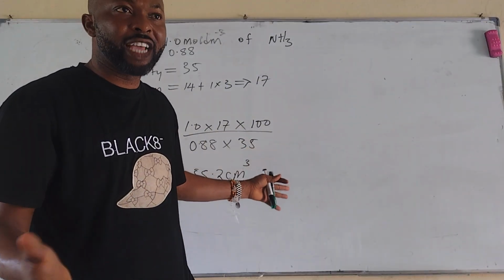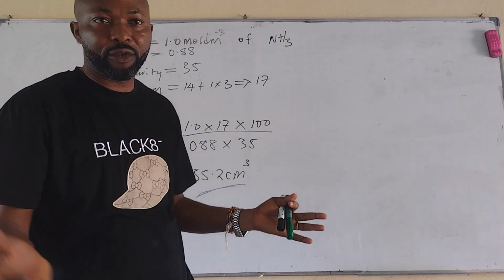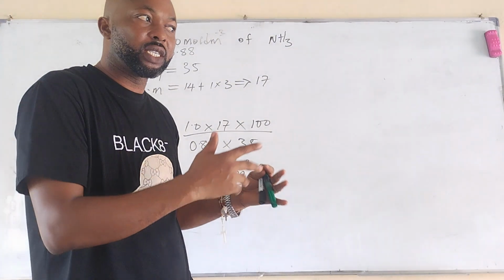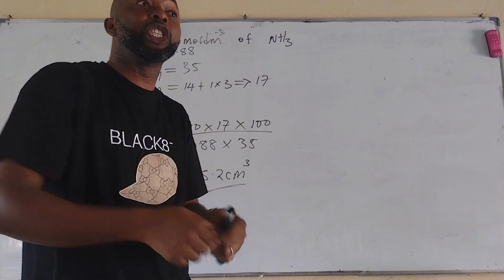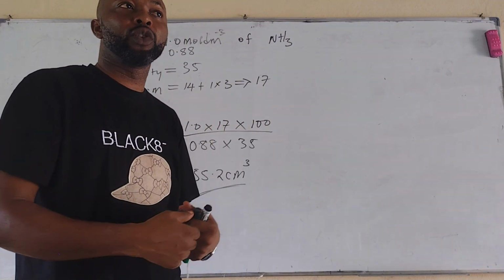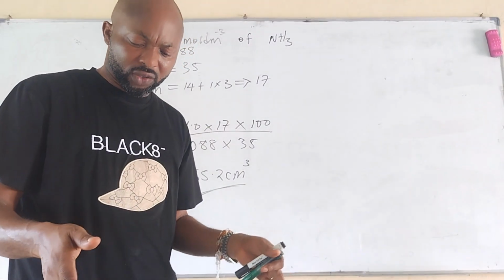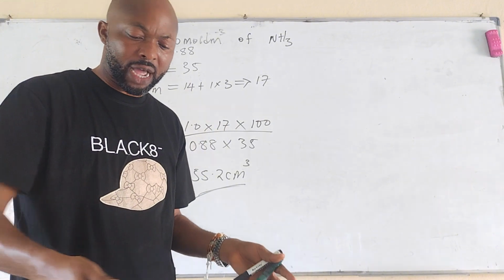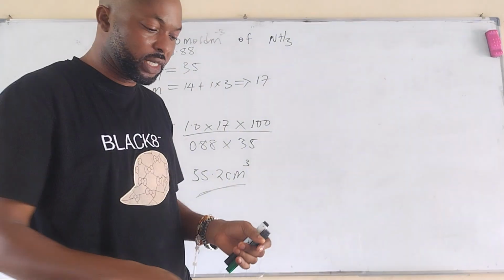Now, probably in our next class, we're going to be dealing with solids, where we use a different formula for preparing that of solid, which is the mass concentration, is the required concentration that should be dissolved in our solution, which is either 1000 or 500, as the case may be. I have a lot of questions on that, so I wouldn't want us to start somewhere and not finish them.